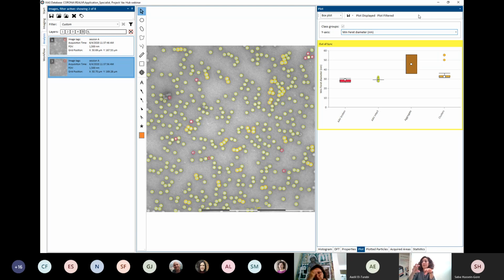So that one came from a comparison that we did with the DLS with the Nanosight one. That information was done by some colleagues and it's actually on our website.